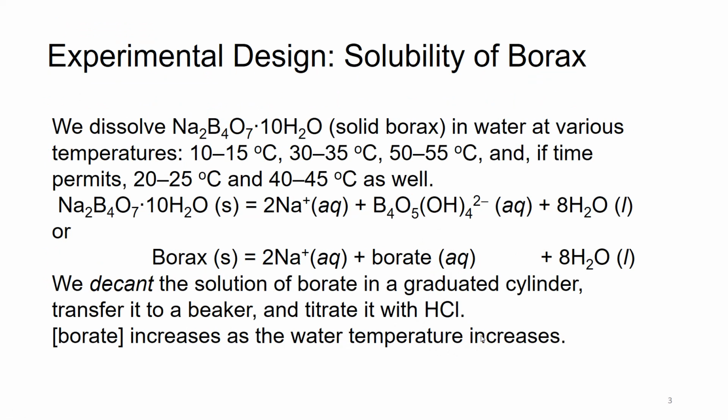Experimental design. How do we determine the solubility of borax? Well, first we dissolve solid borax in water at different temperatures. At least we need to do 3 temperatures. So hopefully we can do these 3 temperatures, and if time permits, let's do 1 or 2 more temperatures.